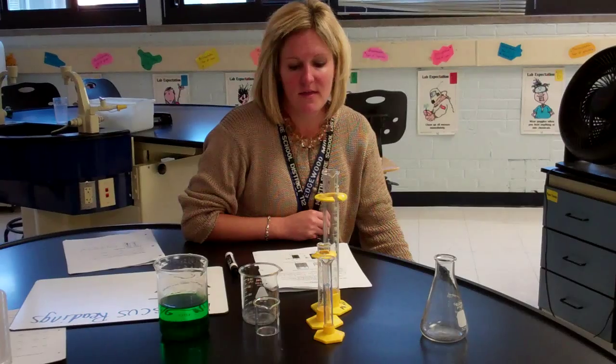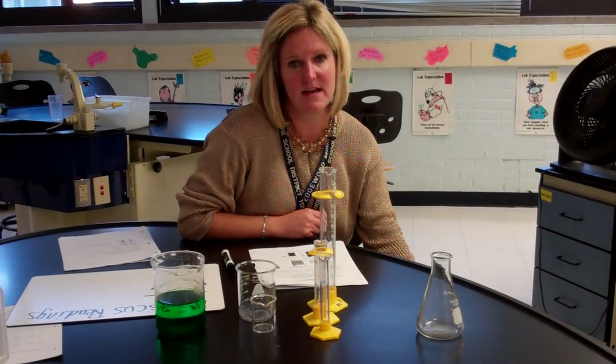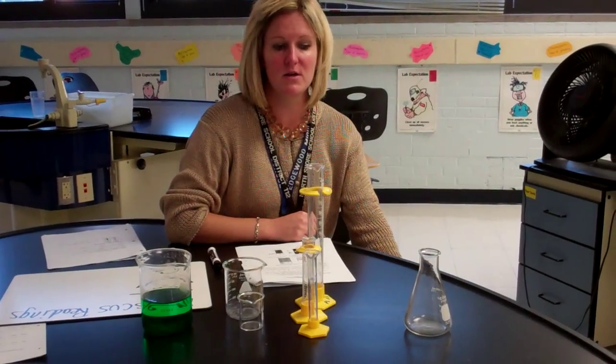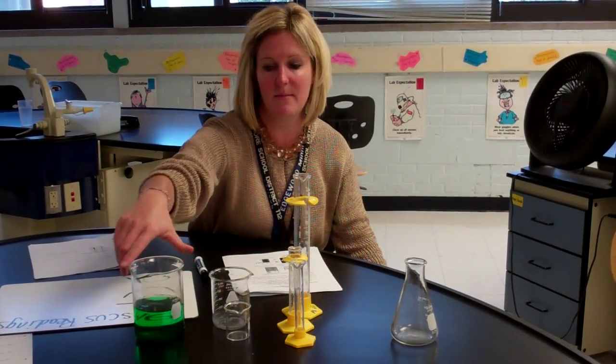We know that the largest unit is the kiloliter, the hectoliter, the decaliter, the base unit of liters, then the deciliter, the centiliter, and the milliliter. We have glassware that we will be utilizing to measure the volume of different amounts of liquids or chemicals.